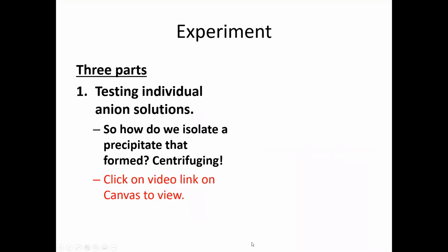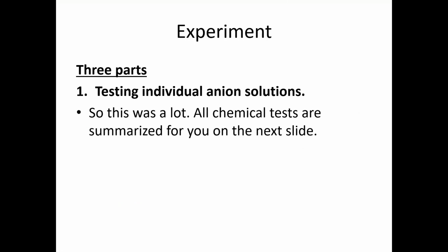Okay. So there is a technique. It's called centrifugation to separate the precipitate from the solution. I have a few-minute video on Canvas. So after the class, you can go there, click on the video, and take a look at the centrifugation process. So this is a lot.